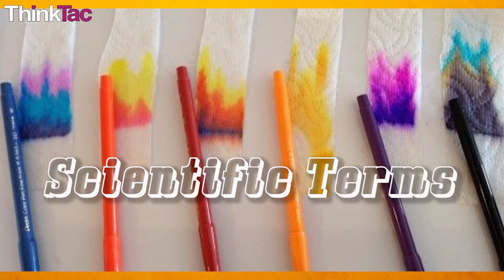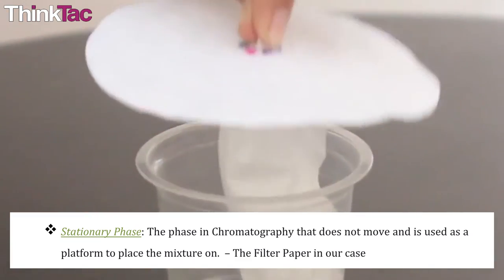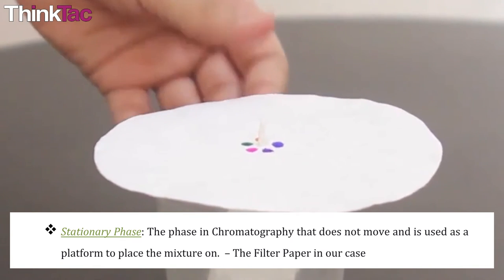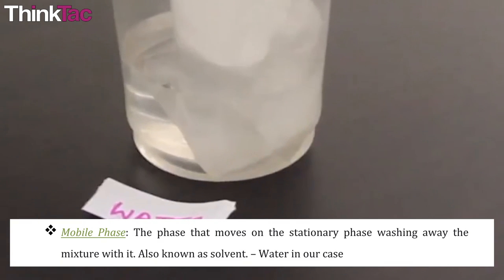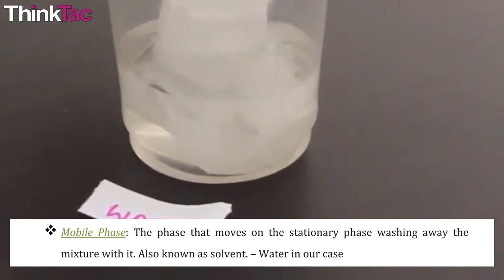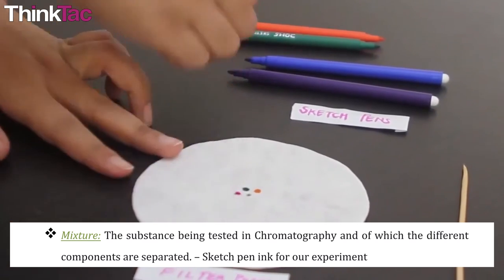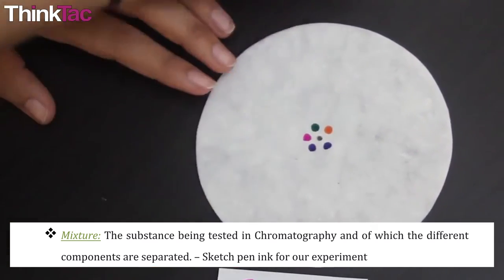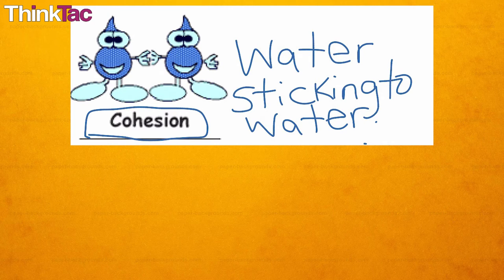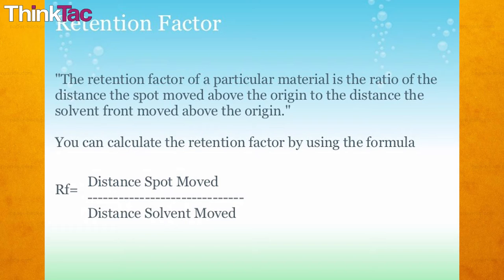Some scientific terms: The stationary phase is the phase in chromatography that does not move and is used as a platform to place the mixture on — the filter paper in our case. Mobile phase: the phase that moves on the stationary phase, washing away the mixture with it, also known as solvent — water in our case. The mixture: the substance being tested in chromatography, of which the different components are separated — it's the sketch pen ink for our experiment. Cohesion is the tendency of a liquid to want to stick together. Adhesion: the tendency of a liquid to want to stick to other materials. The retention factor, also known as the RF value, is used as a measurement to compare distances travelled by each of the components.